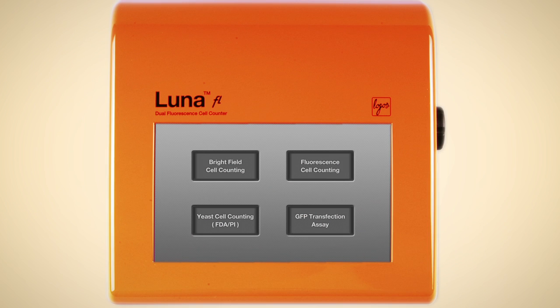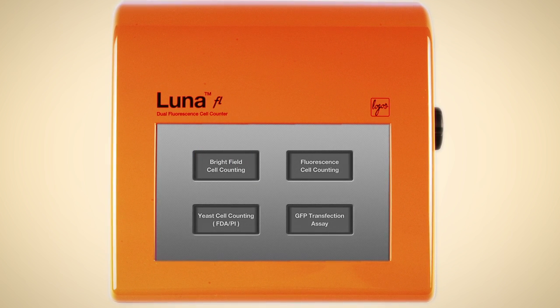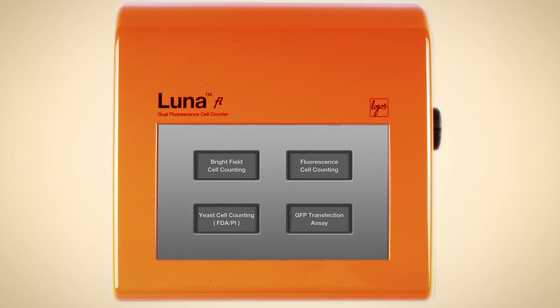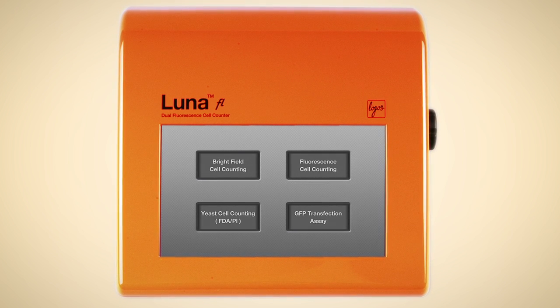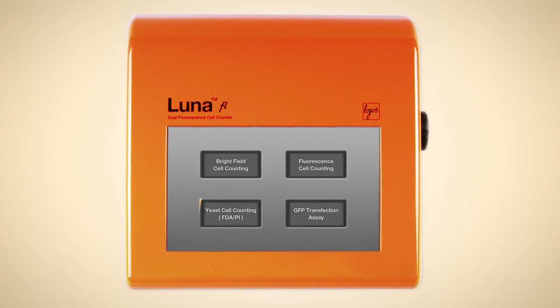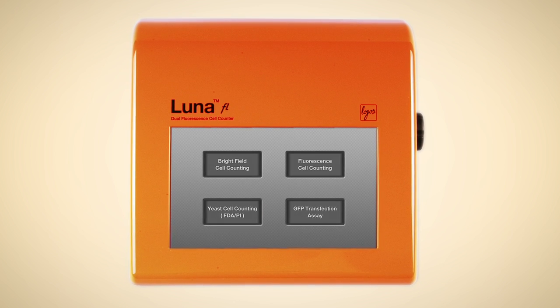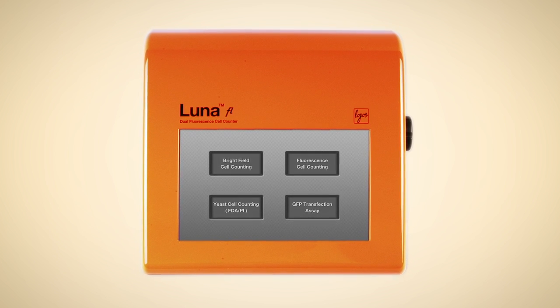For situations where fluorescent analysis is not necessary, bright-field optics are available for trypan blue staining. The GFP transfection assay mode calculates the concentration of GFP-positive cells to measure transfection efficiency. Yeast concentration and viability can also be measured using the yeast viability kit offered by Logos.